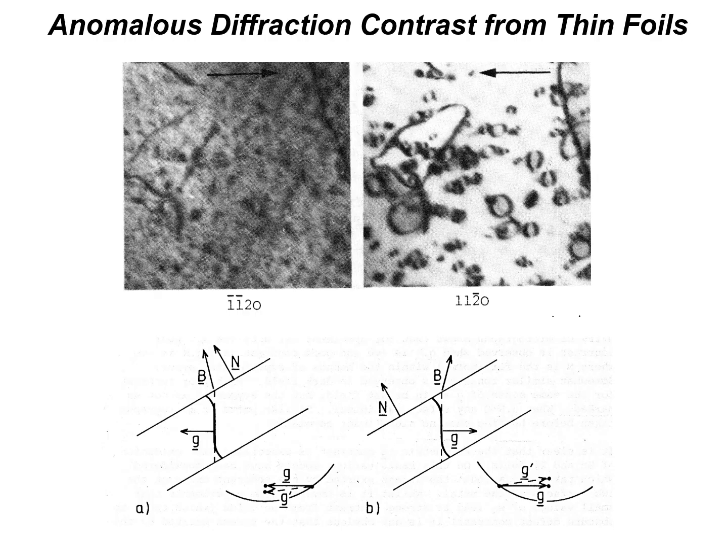Another factor, which is more of an artifact, is some work from when I was a student, electron irradiation. In a high voltage microscope, the vacuum wasn't that great, so there was surface oxidation of the foil, and that gave what's called asymmetric contrast.